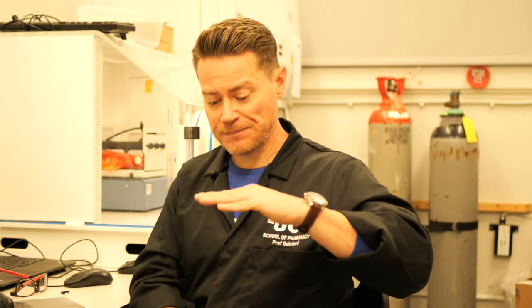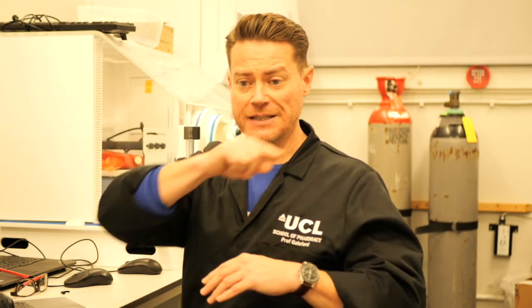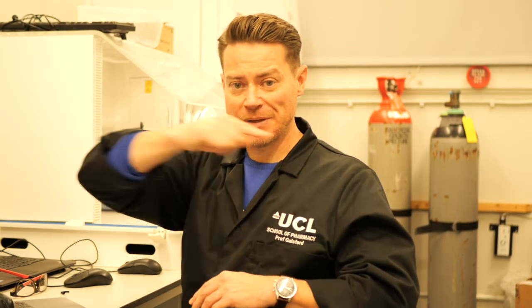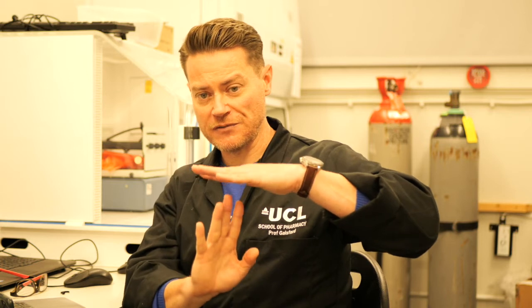So imagine my fingers are the diffraction grating, and below my hand there is a light source which is releasing photons. The photons travel in waves, and those waves have a particular plane. So it might be this plane, but it might also be this plane. So those photons leave the light source and they approach the grid.